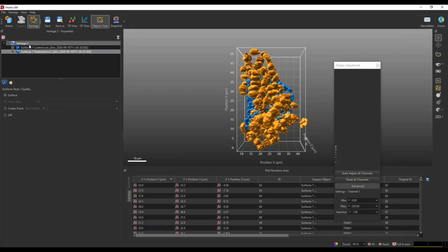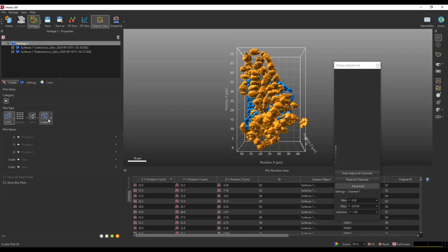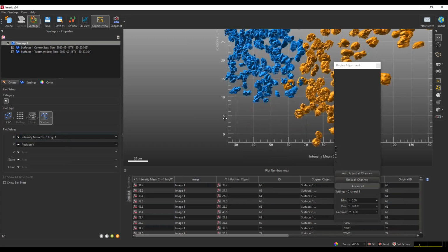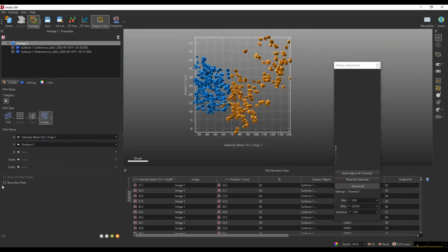Once you have that, you're able to do what Daniel just did, which is to click on both of those folders after the data's been analyzed, and then click on new plot. Then you'll be able to compare two groups to one another, or even more groups than that. So first set up where your images are to make sure that they're together within a folder, and after that, it's pretty straightforward with the new plot button.